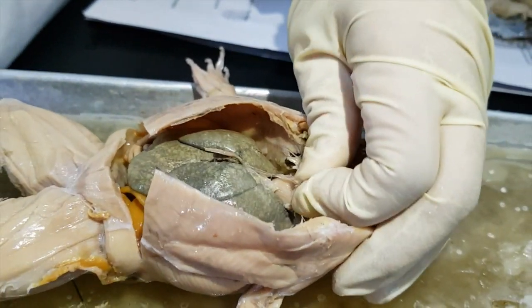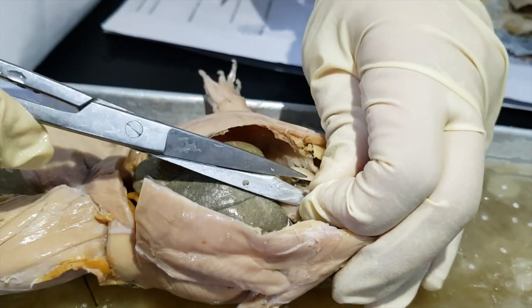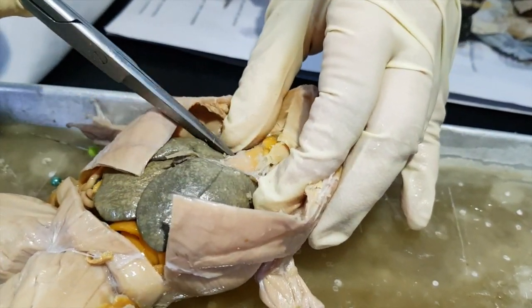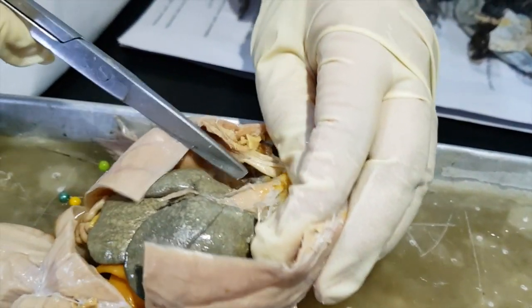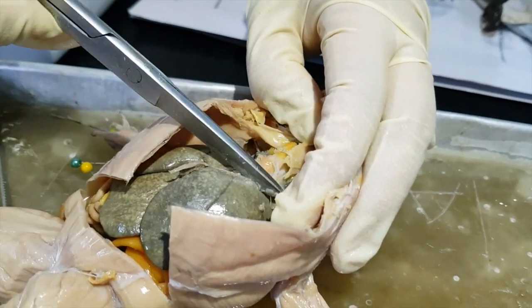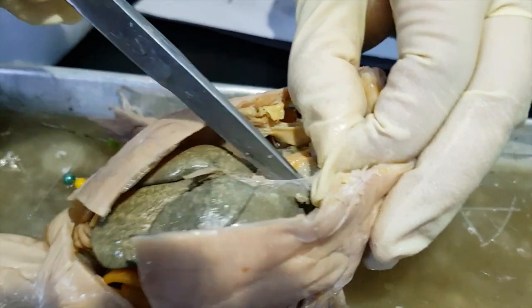The one that covers it is the pericardial sac, which you can cut to reveal the heart inside. Seen here, you would see some visceral fat that covers part of the heart.